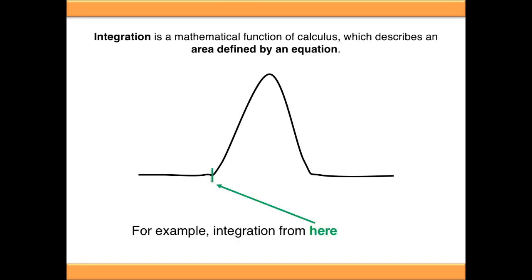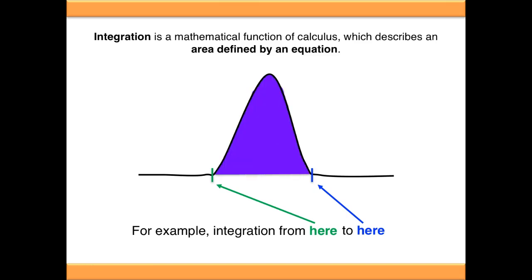So one of the pieces of data which is often found on NMR spectra is the integration. But integration is actually a mathematical function where you take an equation, usually a curve, and by integrating from one boundary to another, what it tells you is the area under that curve. So why does this apply to NMR?